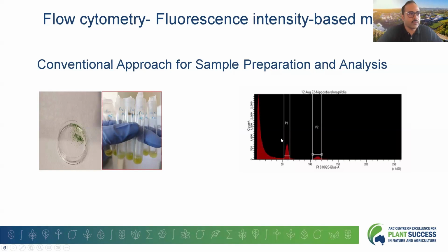we have the nuclei from both species, and we stain them and then load them into the flow cytometer. Based on that, we see different histograms here. In this image, we can see two peaks, P1 and P2. However, this first peak is mostly debris, where we have ruptured nuclei or other cell components or secondary metabolites that can also bind with the propidium iodide. Their fluorescence is usually lower than that of the intact nuclei.